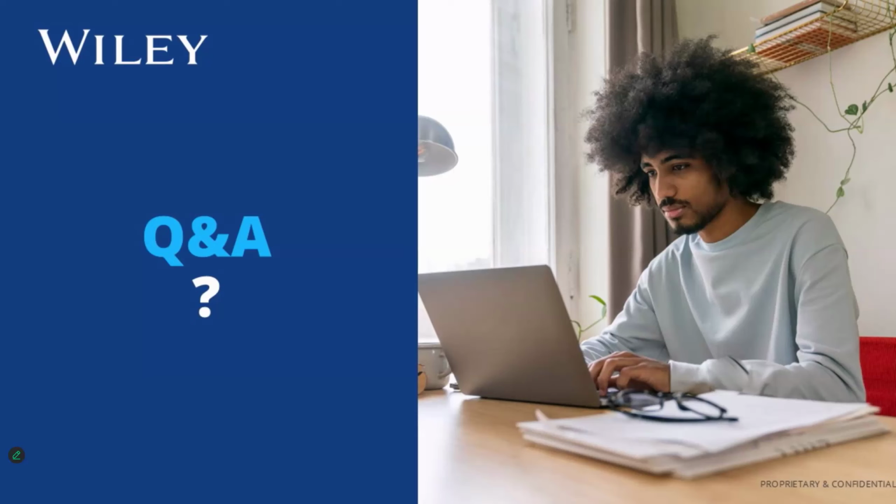So let's see what we have here. Here's a good first one, Michelle. What is unique in Wiley's Trendfinder PCA app?